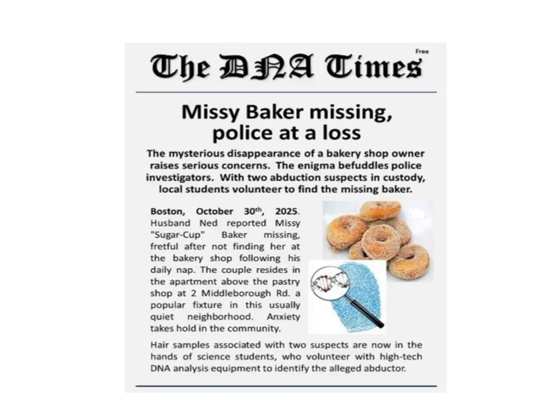So what we have is Missy Baker. She's missing. There are two suspects. Pretty much one of them, or both of them, have a blonde hair in their vehicle that they believe to be Missy Baker's. So what we are going to do is identify if the hair in their car contains the CFTR mutation. And if it does, then we know that Missy Baker was in that car, because unfortunately Missy Baker does have cystic fibrosis, or has that mutation.